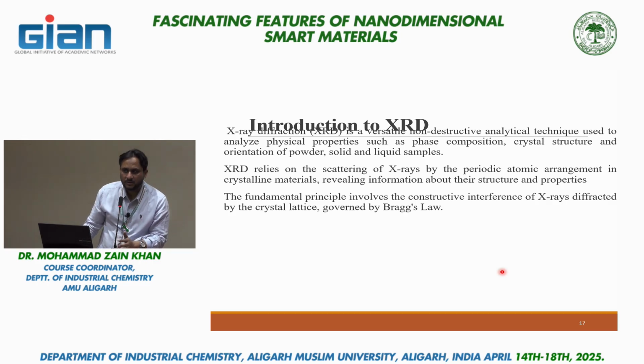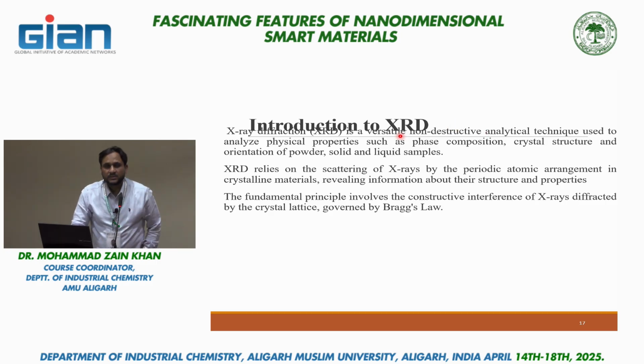So X-ray diffraction is a versatile, non-destructive technique to study the geometry, the phases, the crystallinity of the sample, how the atoms are arranged, the interplanar distance, as well as the particle size.